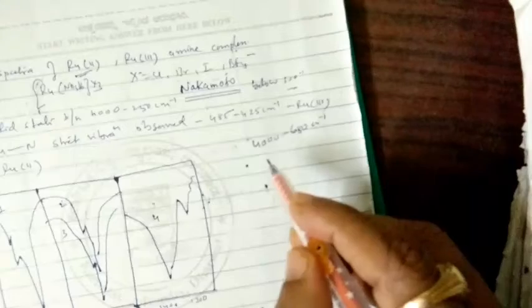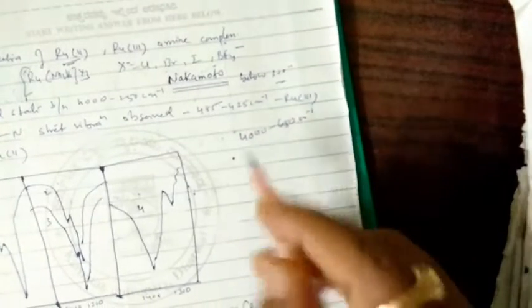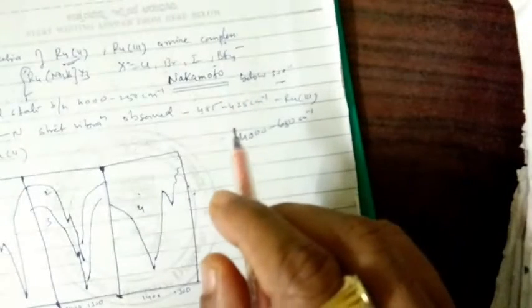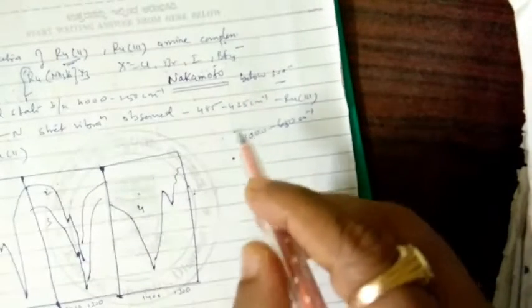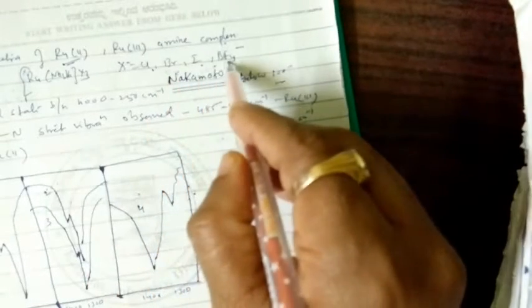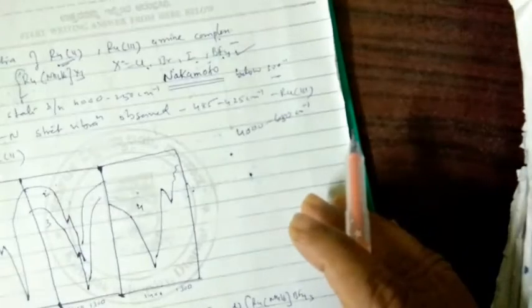You can see for both ruthenium 2 and ruthenium 3, the chloride, bromide, iodide, and fluoroborate salts of this ruthenium hexaammine trihalide X3 were observed.